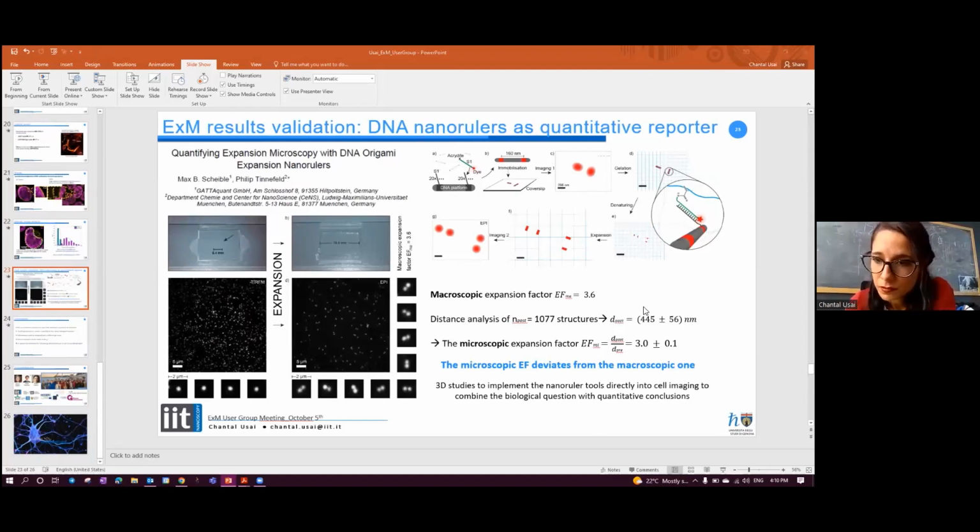George, do you want to go ahead? Yes. Excellent presentation. That was a very nice summary of what's been done so far and a great introduction to the topic as well. I had 2 different questions. One, for the nuclear pore complex labeling, are you using a primary antibody and secondary antibody complex? Yes, at the moment, yes. Have you considered using a conjugated primary or a nanobody if that existed, or doing post-gel staining, which has started to become popular in the literature?